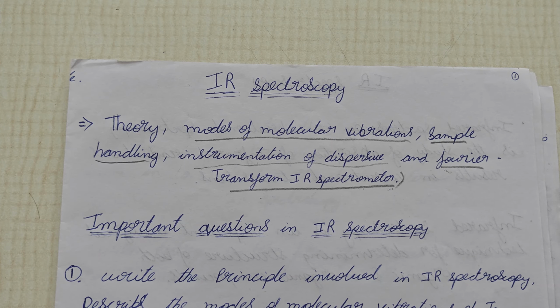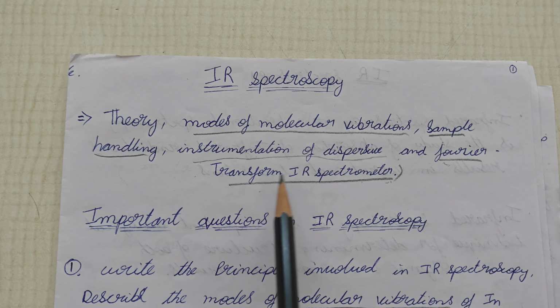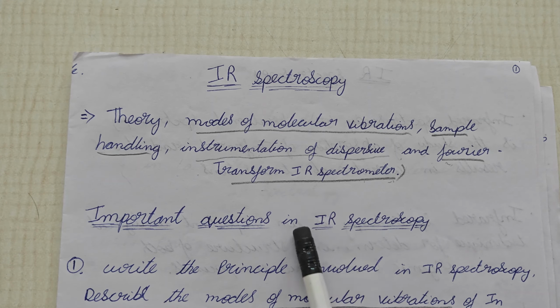In the previous classes, we have discussed the theory, modes of vibration, sample handling, and instrumentation of the dispersive infrared spectroscopy. Fourier transform infrared spectroscopy I have not discussed, but in today's class we are going to complete this IR spectroscopy with the completion of the Fourier transform infrared.